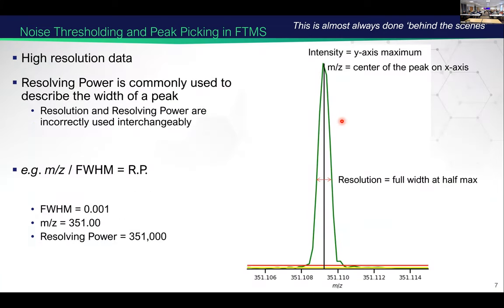And so what we're talking about here are some terms that might come up again and again, or you might see occasionally. So for example, the mass to charge ratio is this exact center point of the peak.